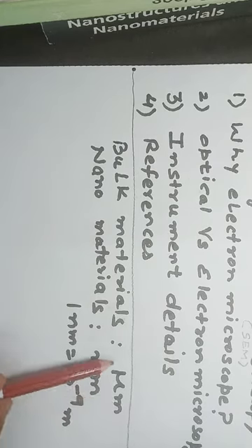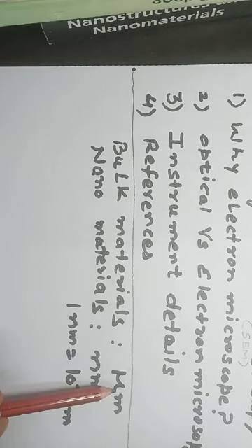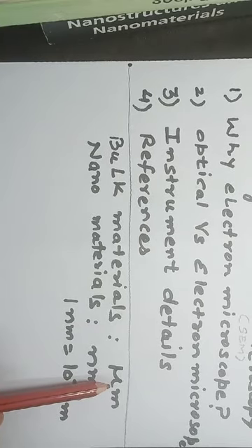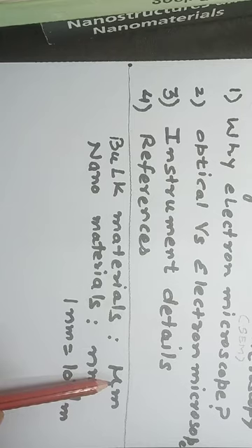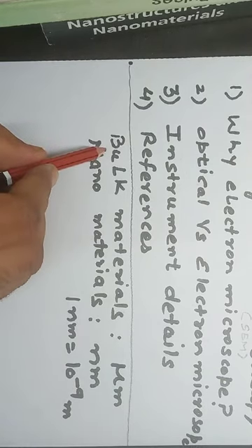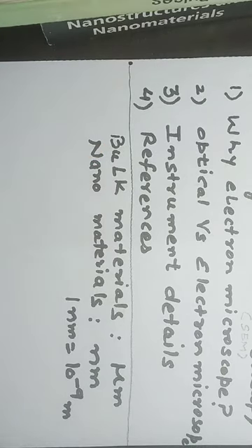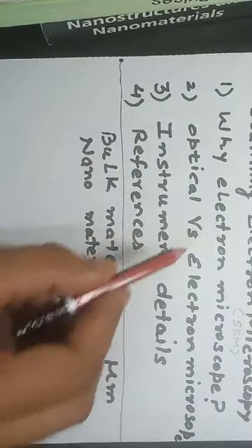Of course, we can also study bulk materials with the help of an optical microscope. We will discuss in our next question how an optical microscope would not be better than an electron microscope. If you would like to record images of a specimen sample to explore its further details, then you will go for scanning electron microscope studies.